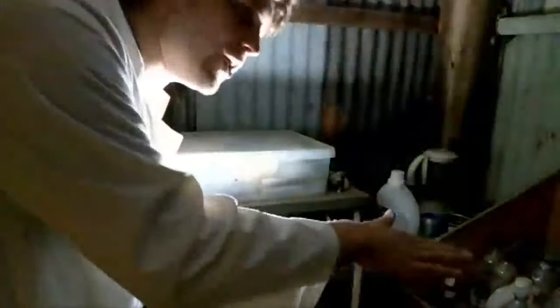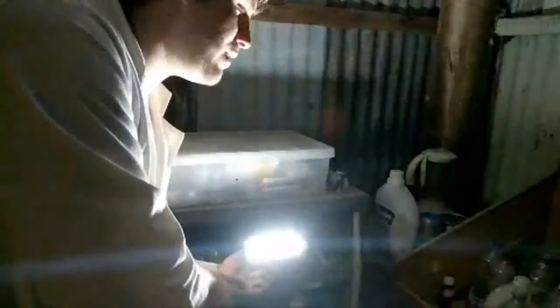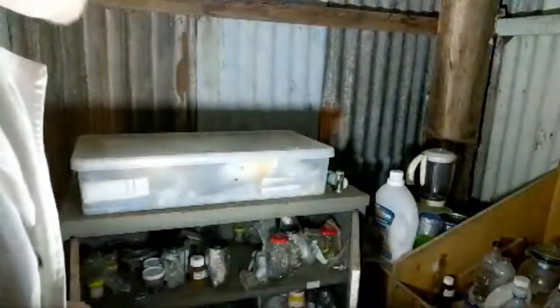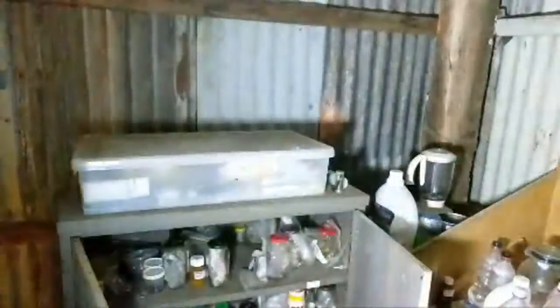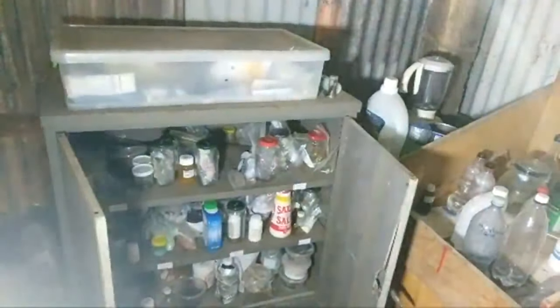But if you do it really well and nothing explodes, it's a way of generating lots of carbon disulfide from acetylene, which you have a whole tank of, and sulfur, which costs basically nothing. That would be a really interesting way to get carbon disulfide, but I haven't grown the balls to try it yet because it just seems crazy. Maybe I had argon and thought about it. Oh, it froze while I'm in the middle of a big story.